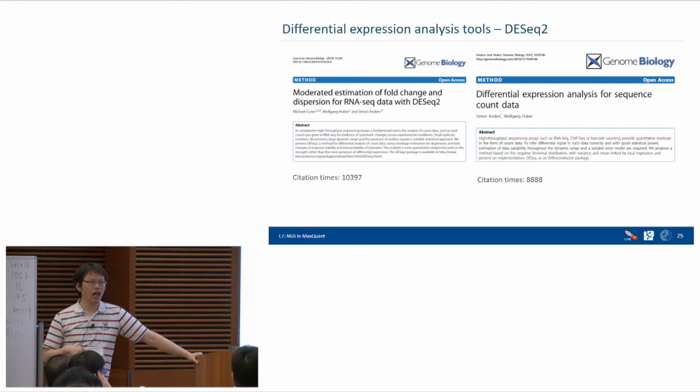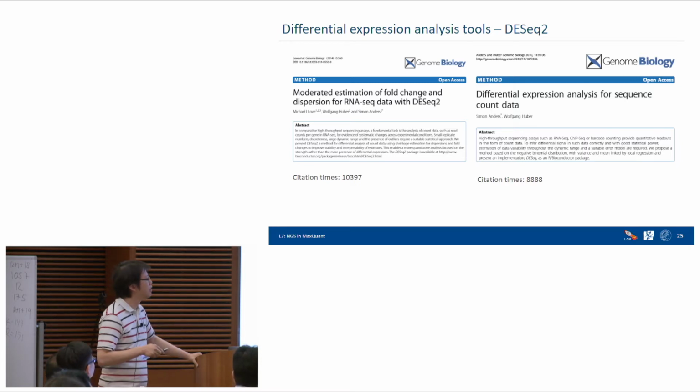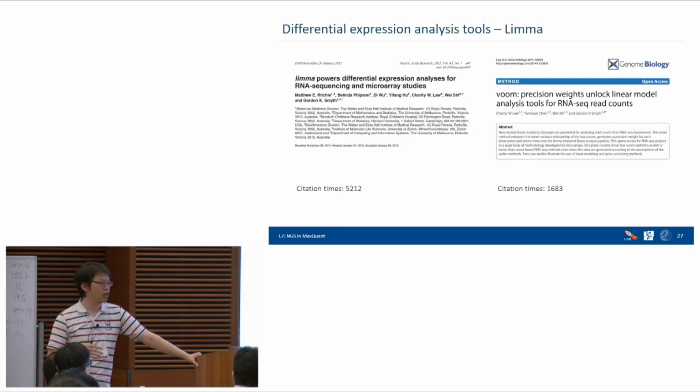But nowadays, there are a lot of tools which can do differential expression analysis for RNA sequencing data. It is mature and really, really useful. One example is DESeq2, okay? Of course, you know there should be a DESeq1. DESeq1 has already been cited almost 9,000 times, and DESeq2 about 10,000 times. You can see it was only published in 2014. Until now, only 5 years, and the citations have exploded. So this tool is very useful. It can detect differential expression very precisely and also provides a lot of information.